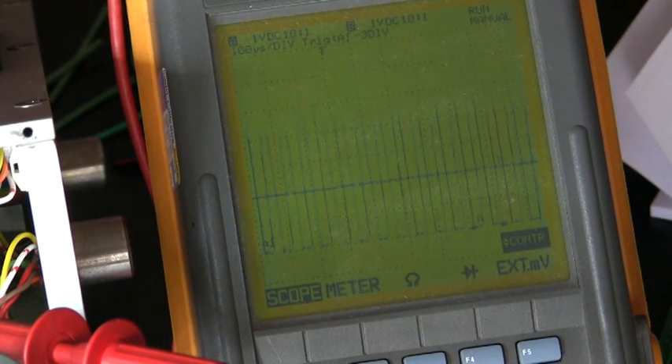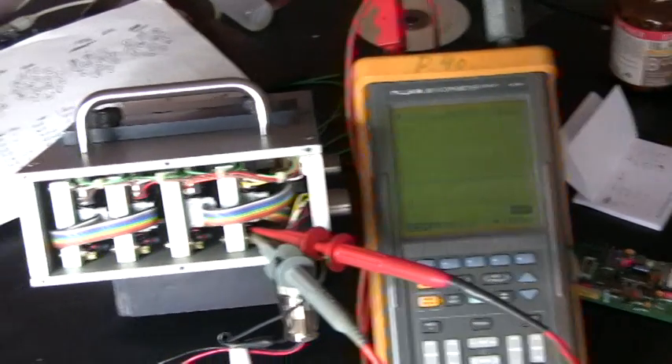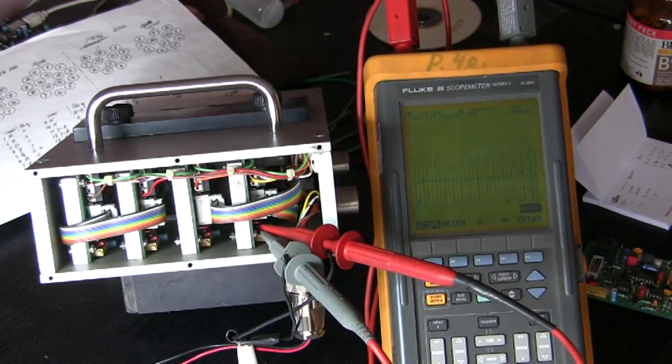Well, that is the calibration procedure. It's not too complicated. The only thing you need is a two-channel oscilloscope, which not everybody has — so then it does become difficult.